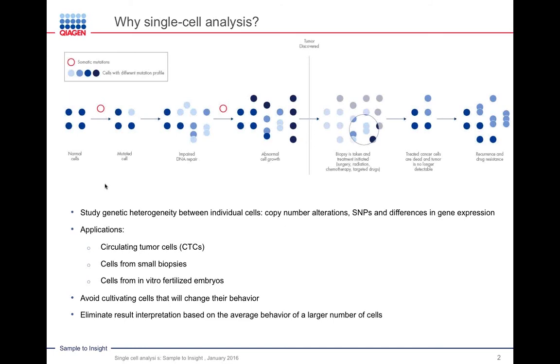Another reason that one might want to focus on single cell analysis versus a bulk analysis is that when you're able to do single cell analysis, you're able to take advantage of the fact that your sample DNA is so precious. You may not have large volumes of DNA.